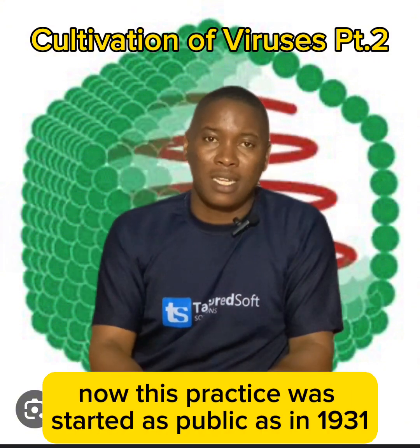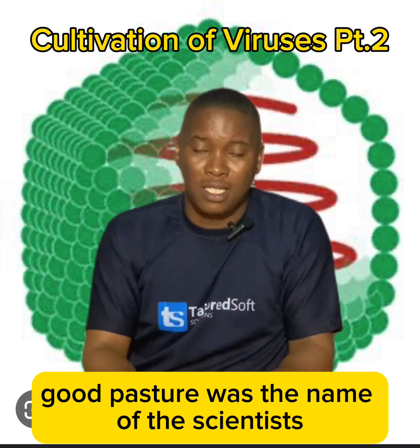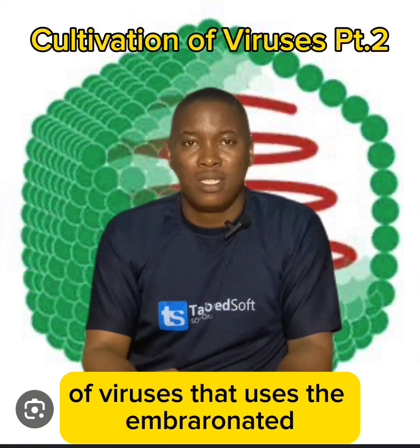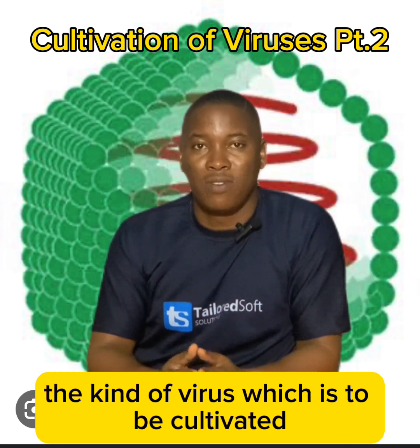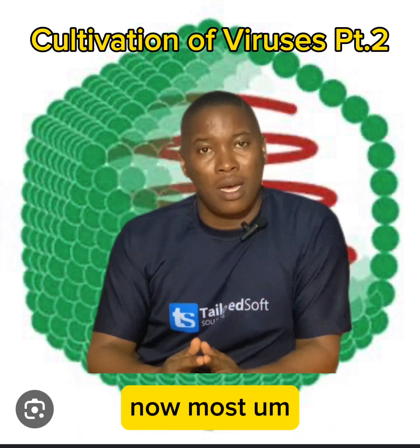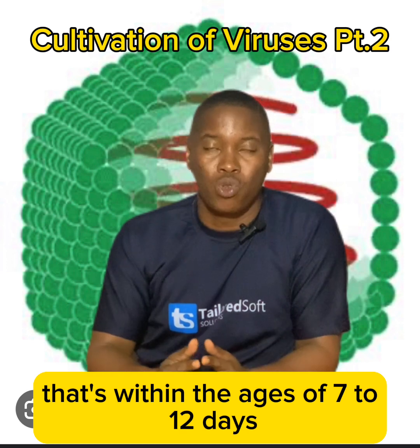Now, this practice was started as far back as in 1931 by a scientist called Good Pasture. Good Pasture was the name of the scientist. He's the one who designed this method of cultivation of viruses that uses the embryonated chick egg to culture or cultivate viruses. Now, the kind of virus to be cultivated will determine the way this method will go. Most often used is the chick embryo, usually within the ages of 7 to 12 days.